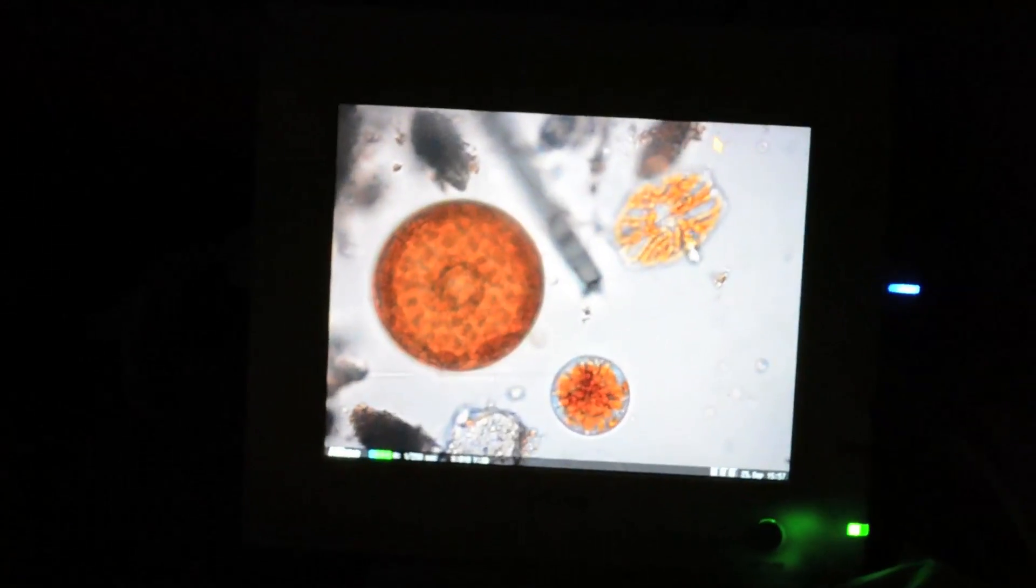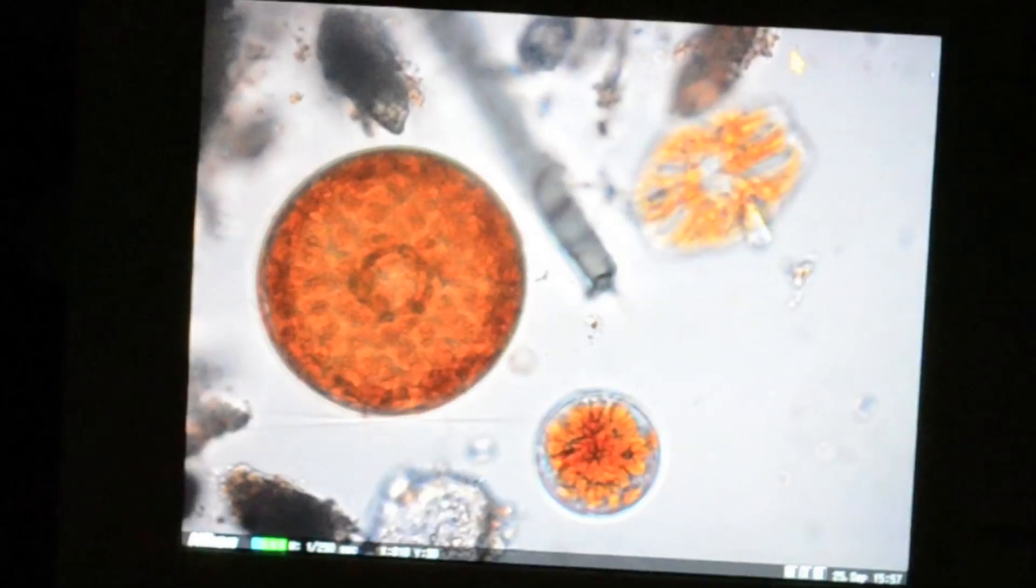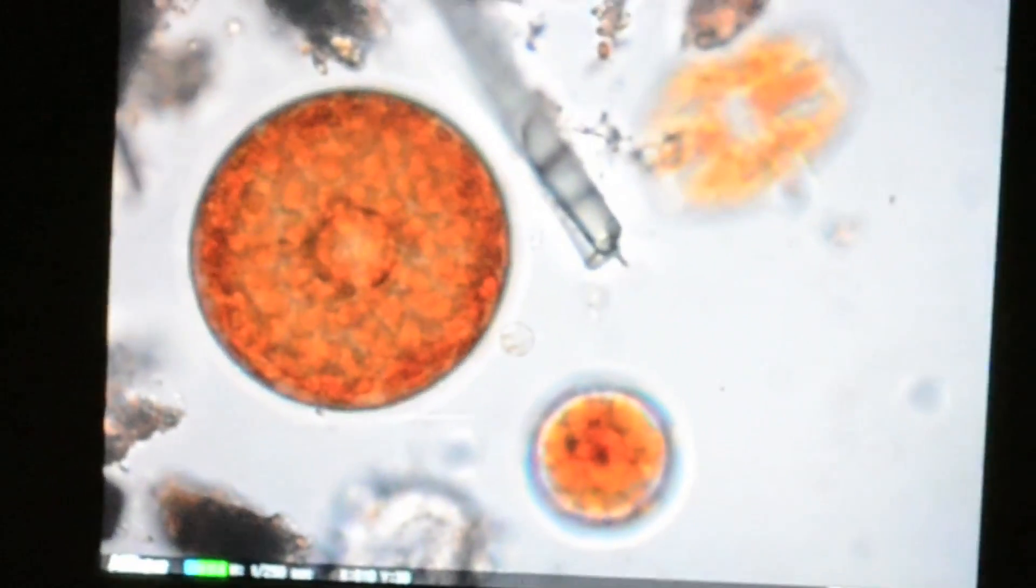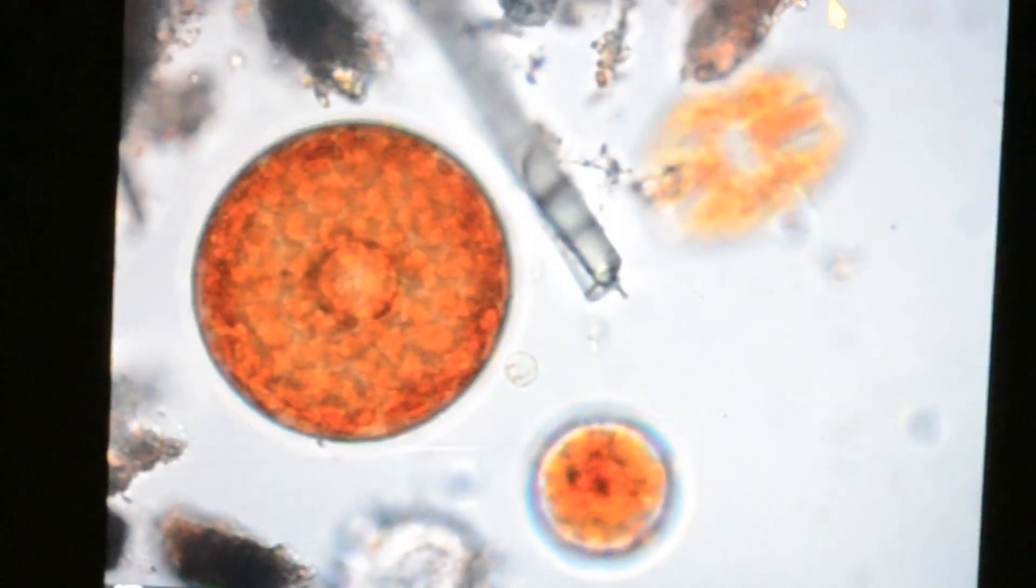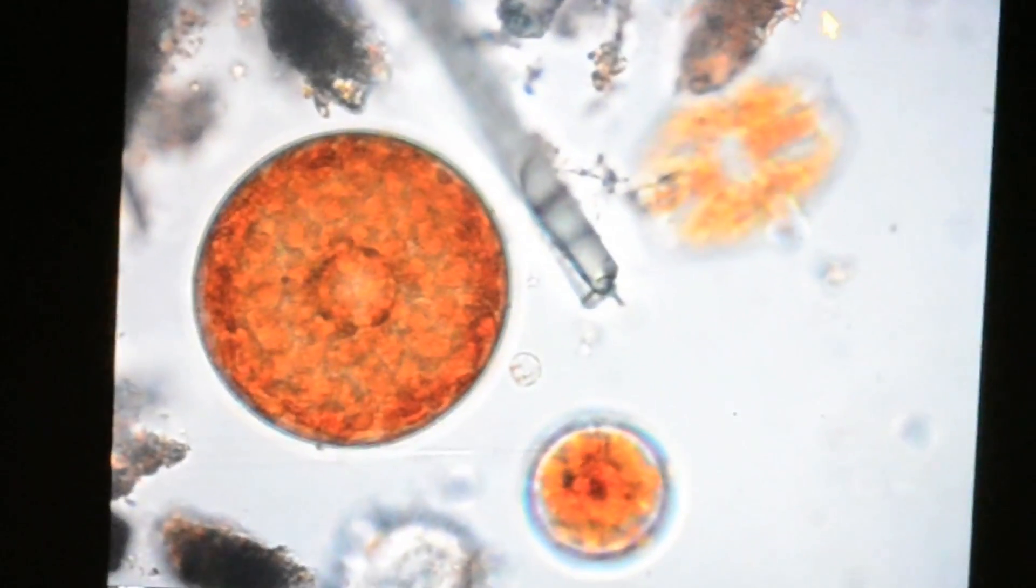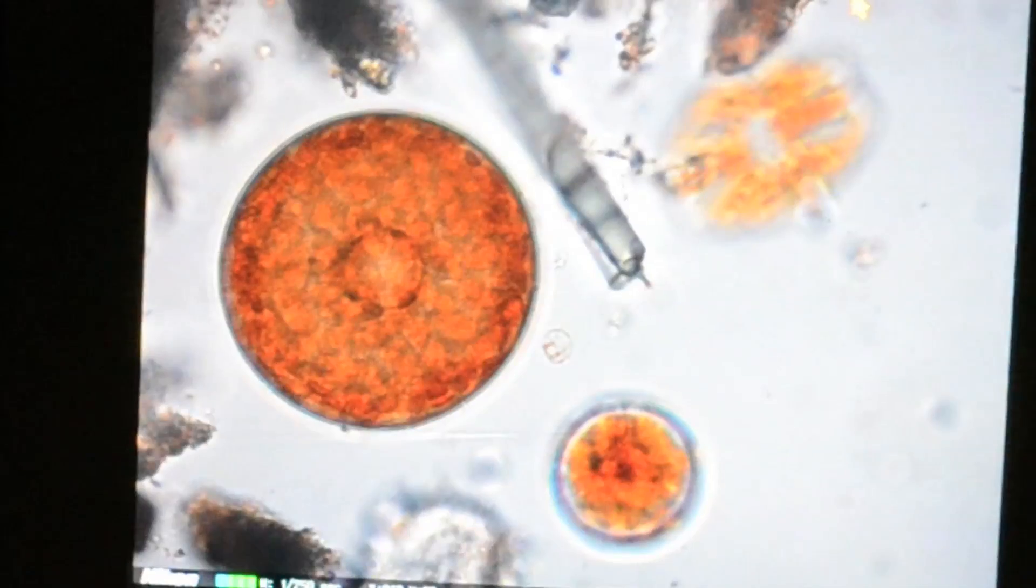What you're looking at here, and I have to focus up and down because they're in different planes even on the slide, this one here on the left is a Cosinodiscus oculus iridus. If you imagine a petri dish, what you're looking at is down on top of it. The walls are made out of glass.